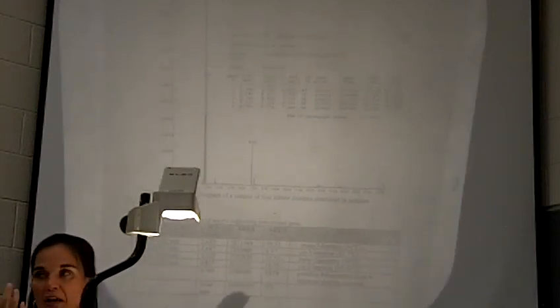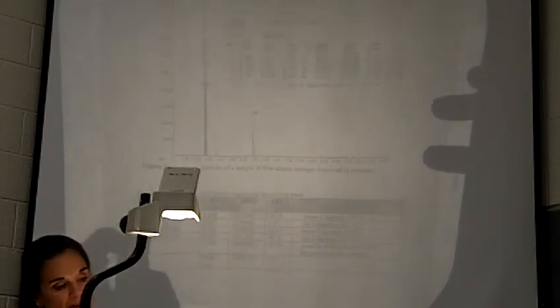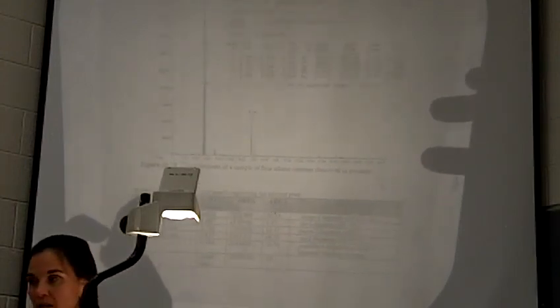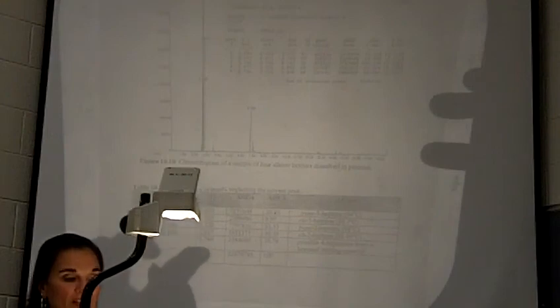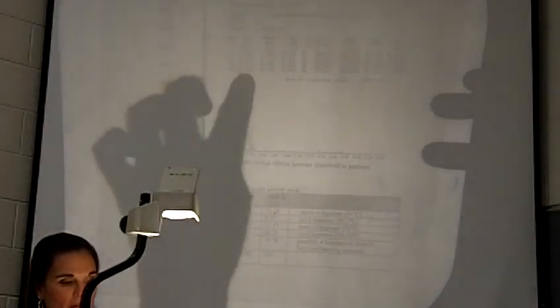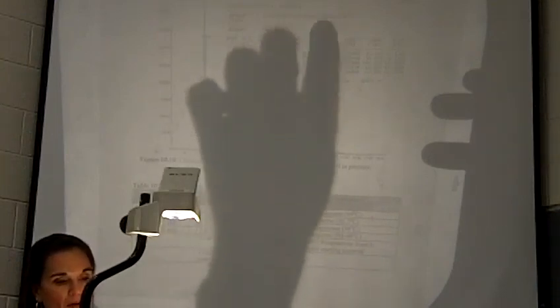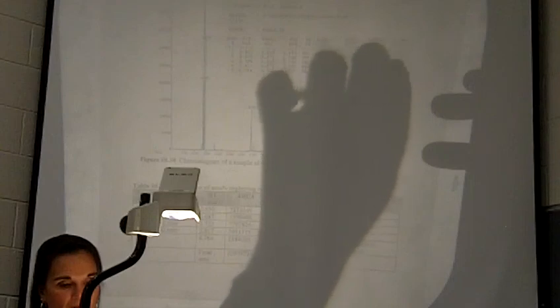So you're going to make sure you include in your report your GC data for experiment 8 and 11. You're going to attach that to your notebook when you hand in your report. This table is also table 10.2, so it's in experiment 10. You want to have a column for standard retention time, and a column for the retention time off your data. This is the standard retention time that you get from your lab prof, and this is the retention time from your data. You want to give the area and the percent area, so peak area and percent of total.